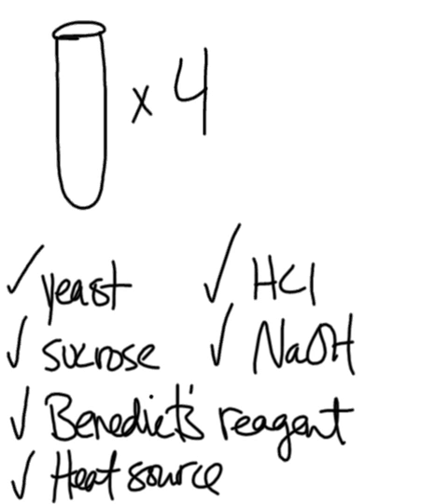But you'll notice an obvious color change. And in order for this reaction to happen a little faster, we're going to have a heat source, probably a hot plate with a beaker of water, so you can just set the test tubes in there and then it'll heat up. Okay? So, you're going to have 4 test tubes. Okay? If you want to have a 5th, you're welcome to. If you want to have only 3, you're welcome to. But how I see this lab happening, I see it happening with 4 to make sure that you cover all your bases in a scientific sense.